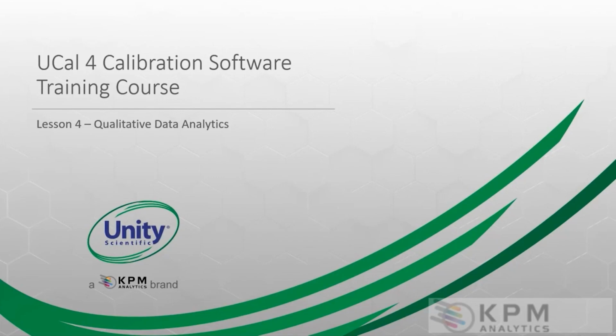Just a quick note about qualitative data analytics. I think this is a very exciting part of near-infrared evaluations. There are a lot more variables in this. It's not as straightforward as doing a simple quantitative evaluation and a quantitative prediction of a constituent.